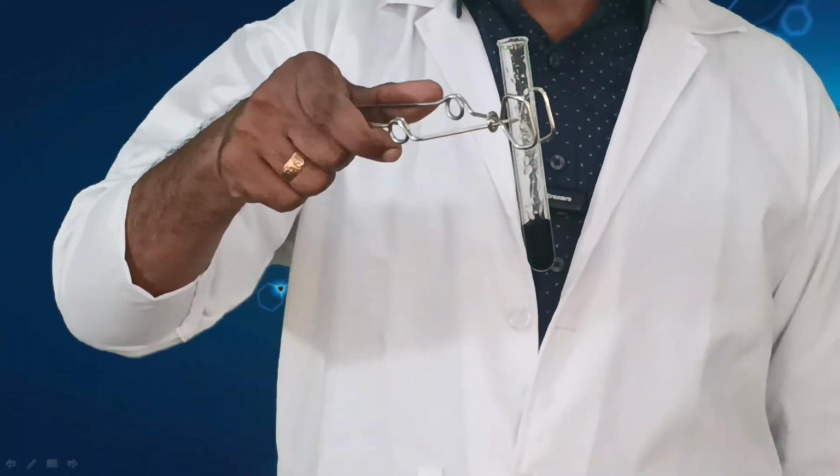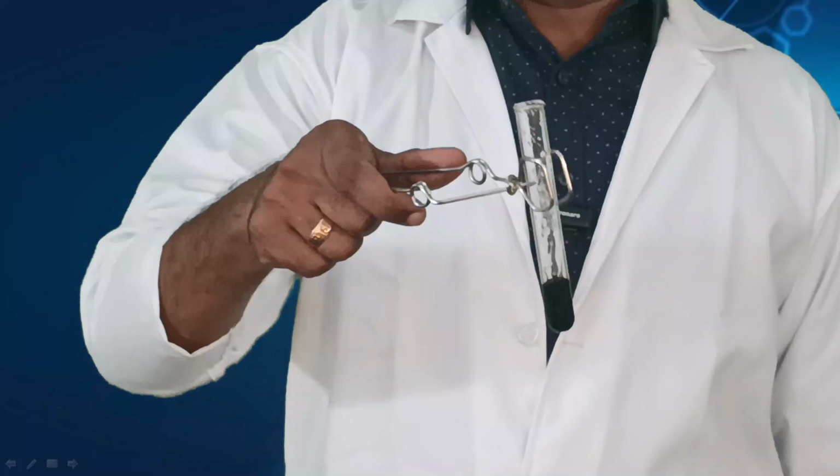This is called charring, and this charring shows the presence of a carbohydrate in your substance.